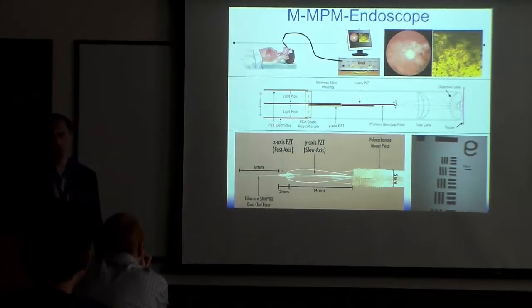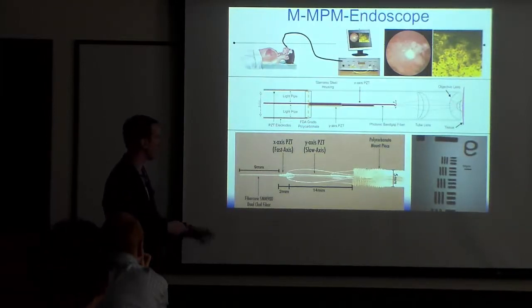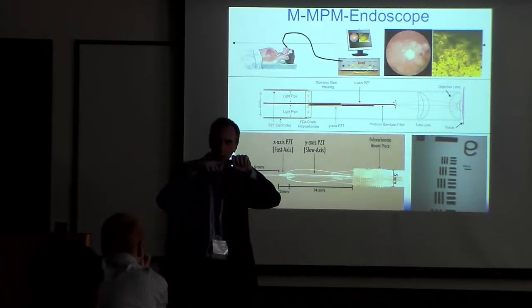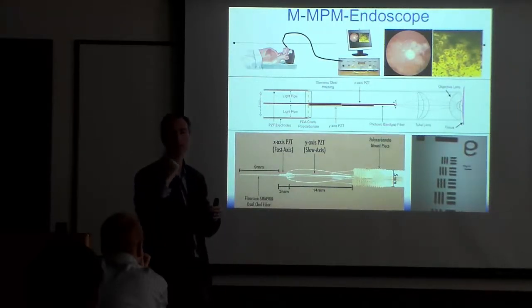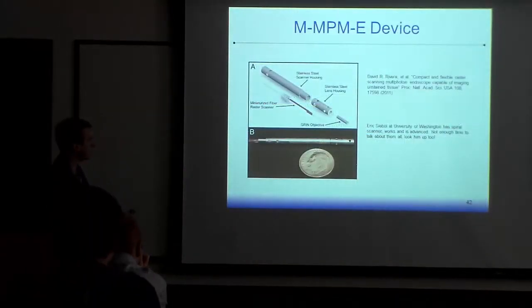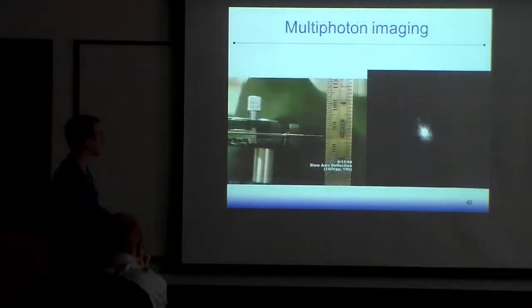And one thing you can do is make endoscopes, and so you can basically just put a fiber on a piezo actuator, so that you can raster scan this, and you have a fiber that's a dual clad fiber, so light can travel down the center core, and then when it hits your sample, it comes back out, and you have this outer cladding, which then will couple the light back towards your detector. So these are techniques people can do. You can package this into a little setup here. A couple groups are doing this. So I have one citation here and another group here, and later on I'll show you a third group. You can look them up if you're interested in this.